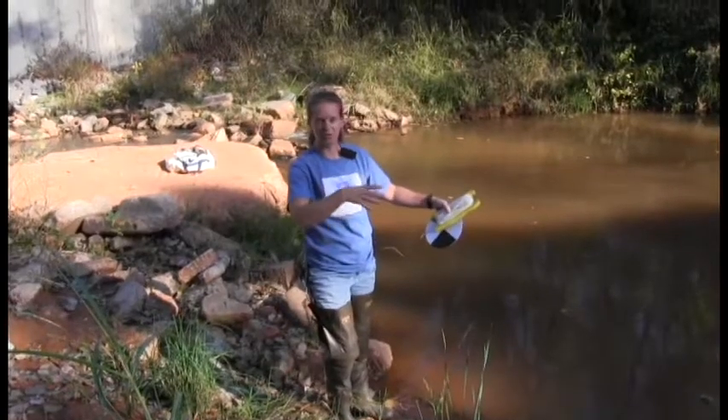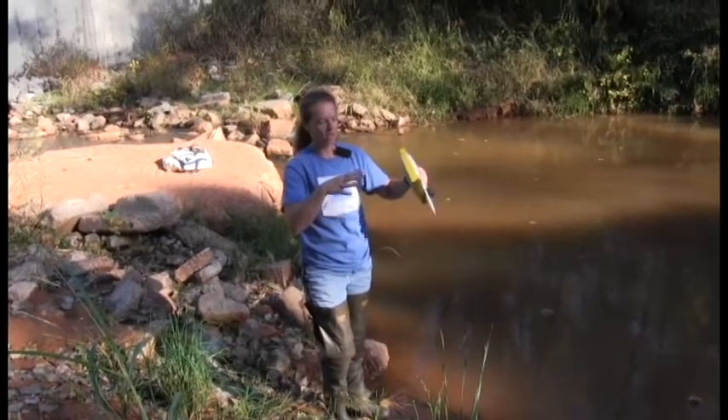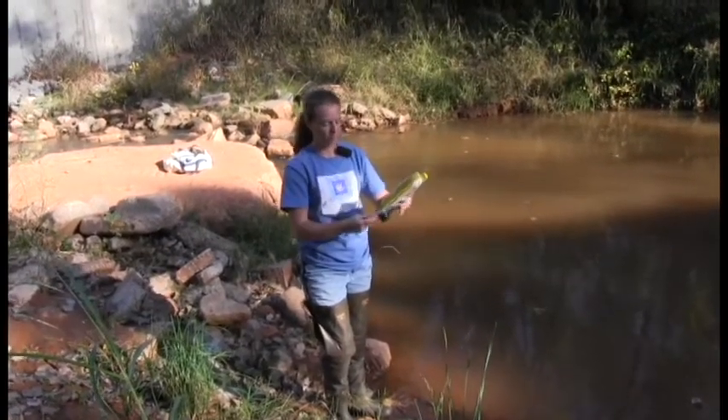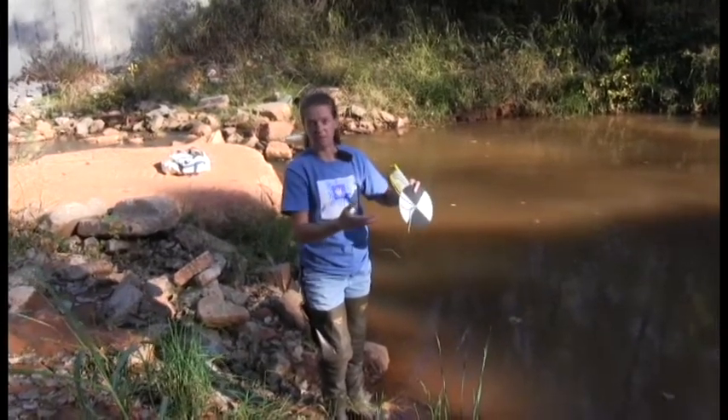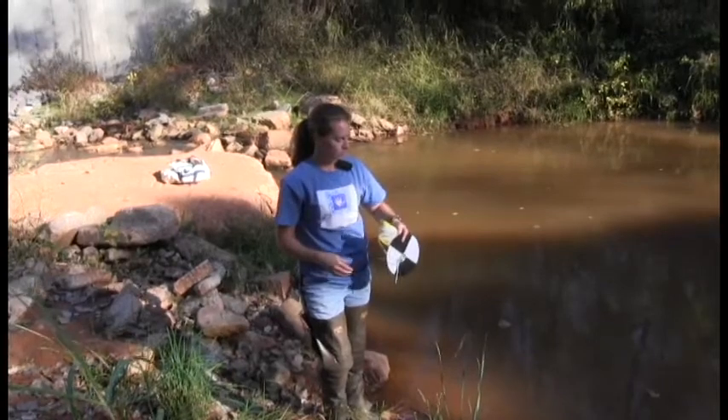Now we've come down here to the pool part of West Elm Creek. A pool is the best place to measure secchi depth because that should be about the deepest spot within the creek within walking distance.